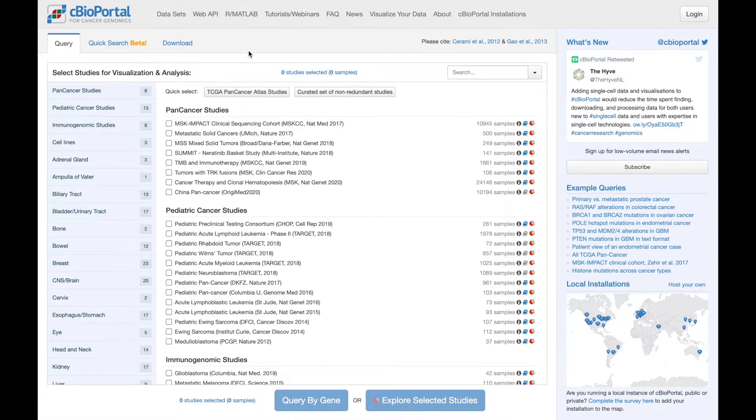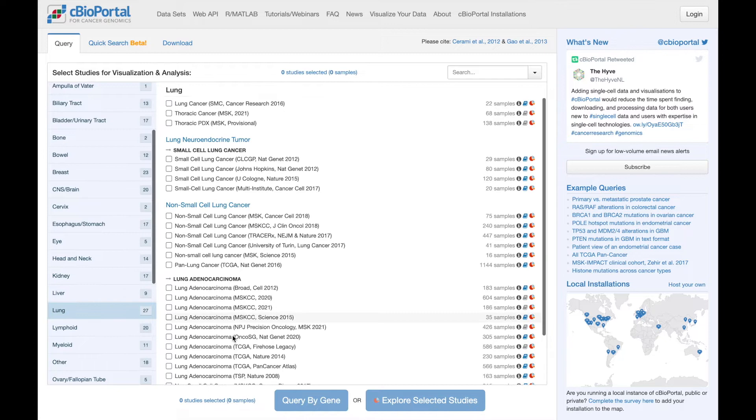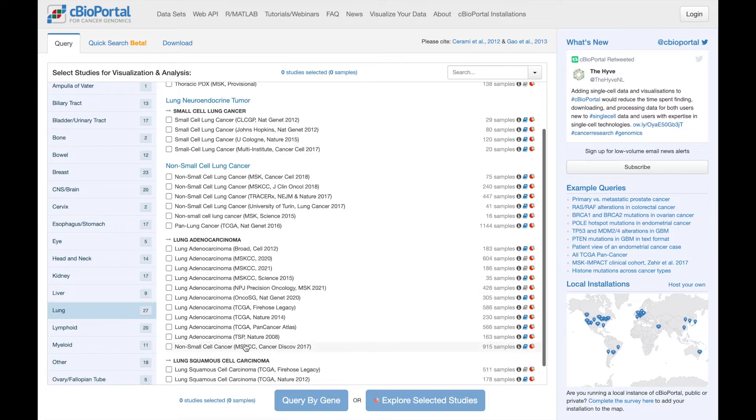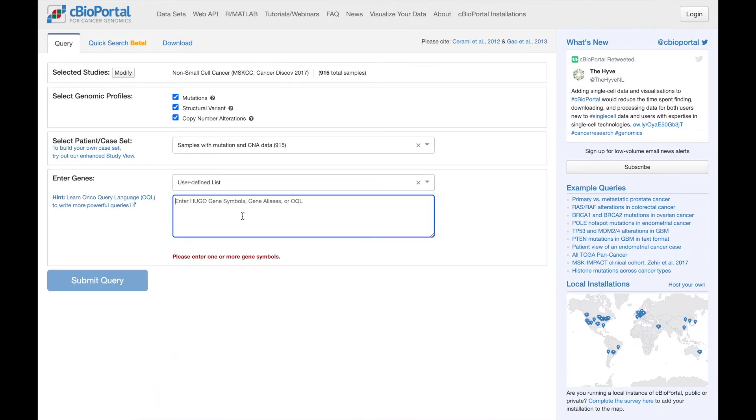To get to the mutations tab, we're going to run a query. Here I'm selecting a lung cancer study, this one here, and I'm going to query for EGFR.